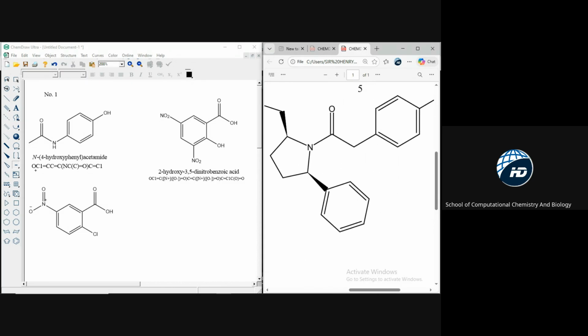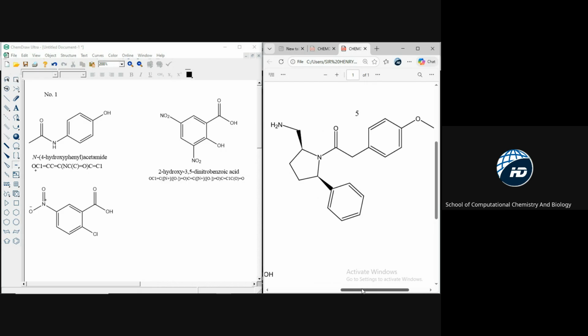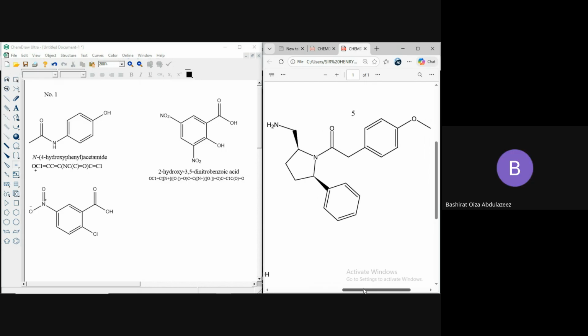Then number 5. Are we together? Yes, sir. All right. So this is very important. You get familiarized in structural representation.